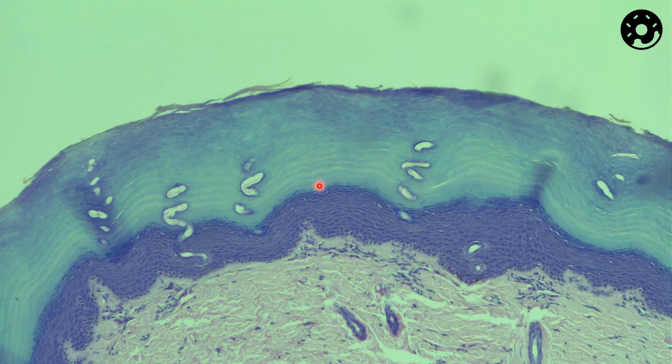And then we have the Stratum Lucidum. Stratum Lucidum is going to be a thin layer in between where this kind of translucent blue ends and this dark purple begins. So it's just a thin layer right above this dark purple.